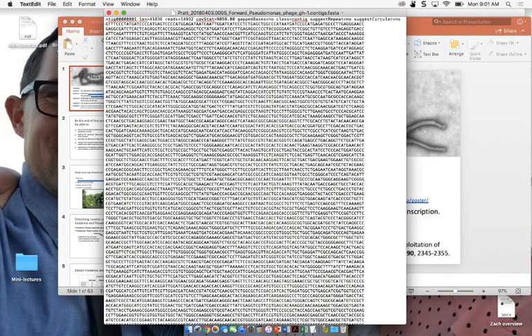The thing to note is that at the top here, it's going to give you some basic information. Like it says, reads 14,932. In other words, this DNA sequence was read 14,932 times, so it should be pretty accurate. It's going to tell you other things, like that it's not likely to be circular, and there are no suggested repeats.